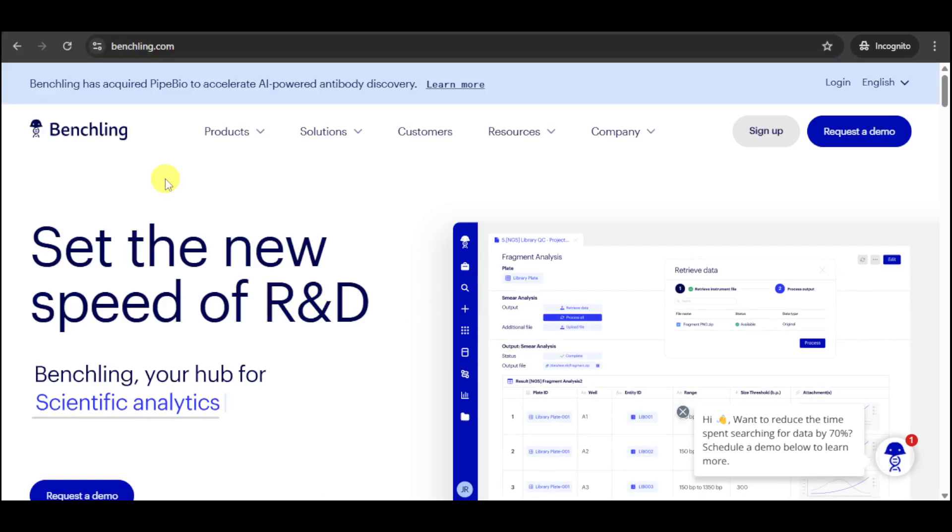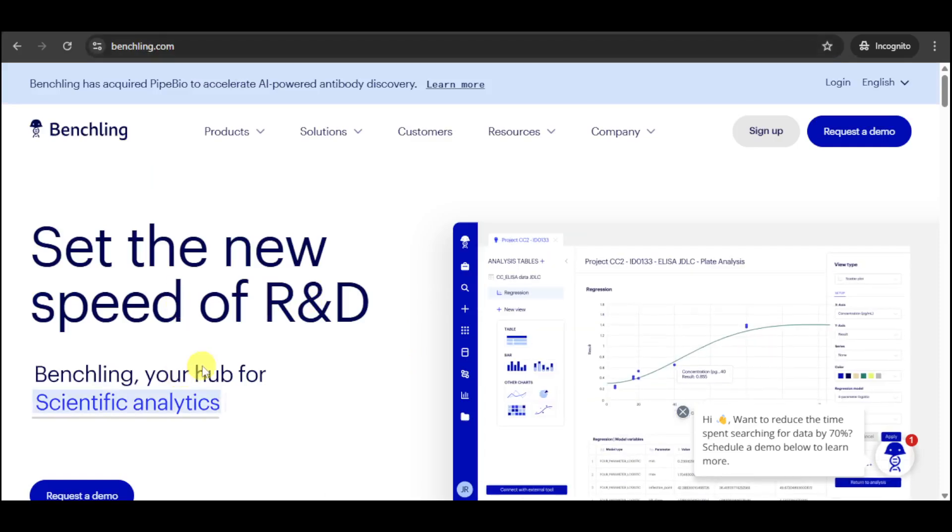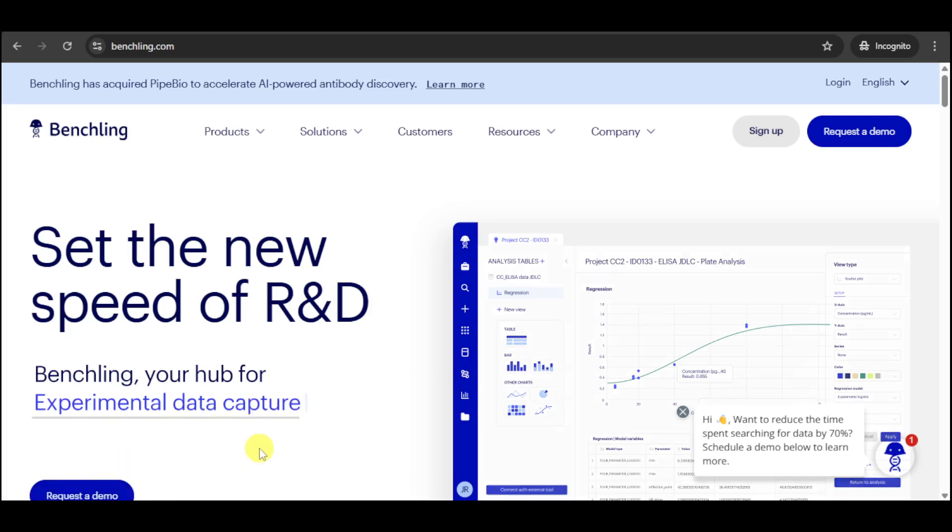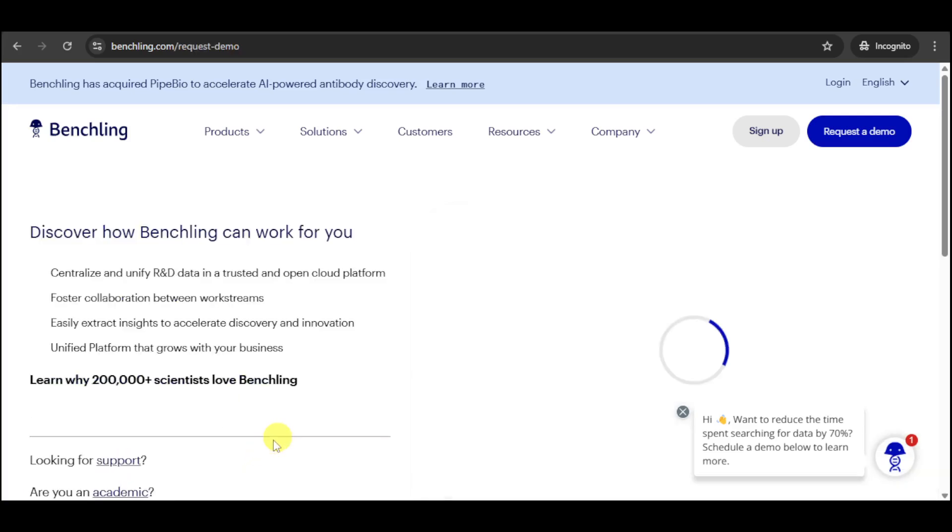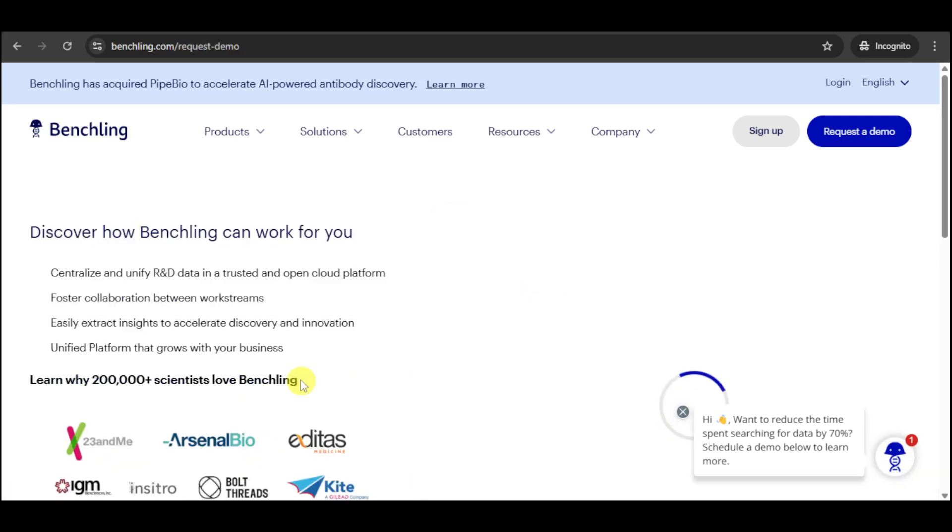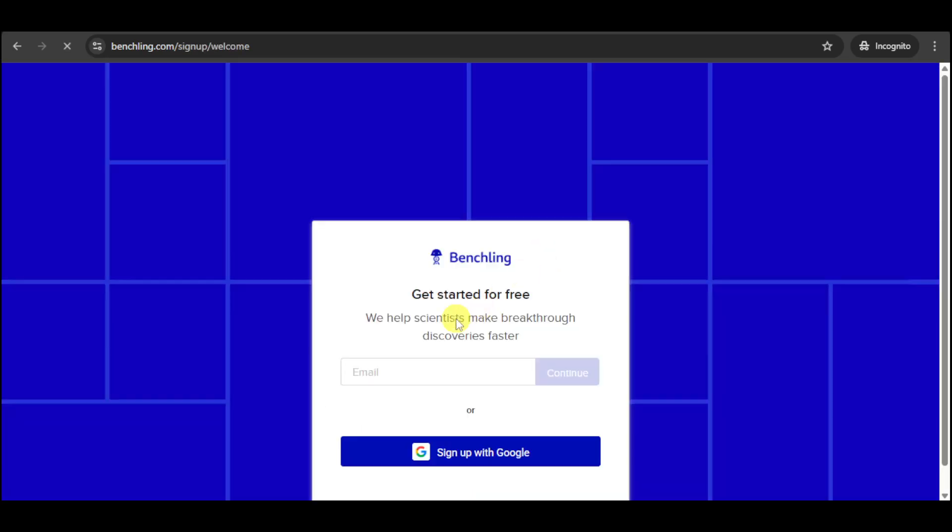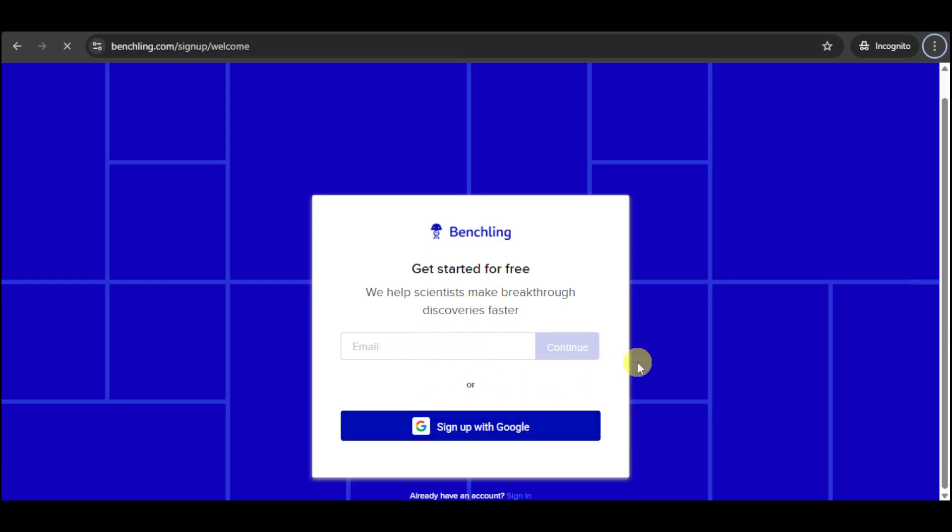You can sign up for free or you can also request a demo. You can click on this request a demo option right here, and then in here, you just fill up the information in order to actually get a demo of this particular platform. On the sign-up page, just head over and input your email, or you can also sign up with Google. Just continue doing that and provide the password that you can use, and then from there, you should be able to sign up for a free account on BenchLink.